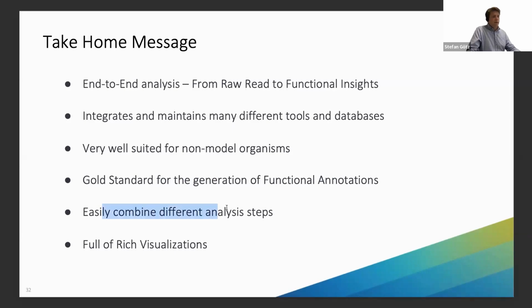And there, when working with the side panels, you can really easily combine different analysis steps, and each individual step offers a lot of different rich visualizations to review your intermediate results, but also the overall functional interpretation and visualization of functions is possible here.